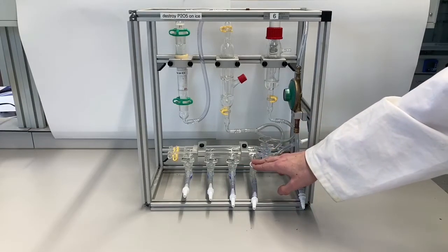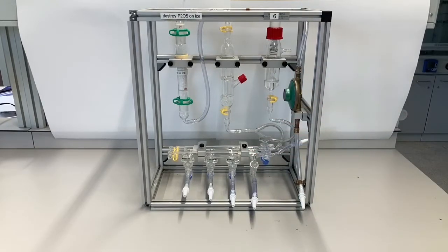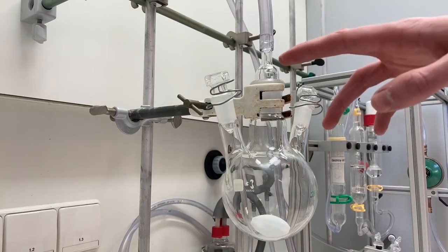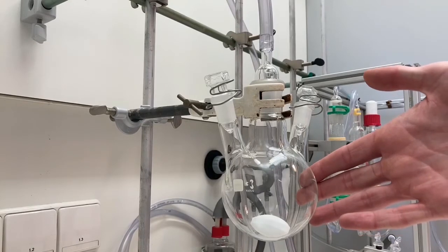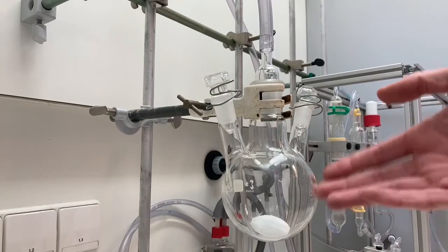Now we will show an example setup with the nitrogen rack in the fume hood. Here we have a simple three-neck flask with a stirrer and a male adapter connected to the nitrogen rack. We will show you how to connect this under an inert atmosphere. If your reaction requires dry conditions, make sure you dry your glassware in the oven overnight and leave it to cool down under vacuum.